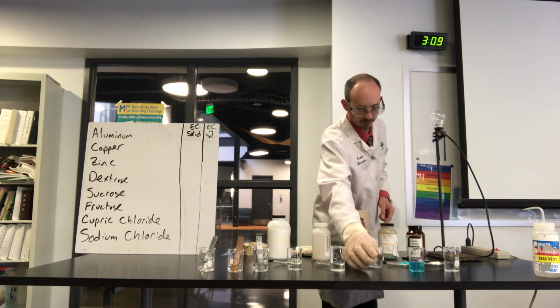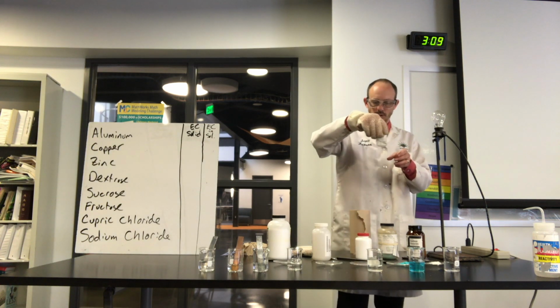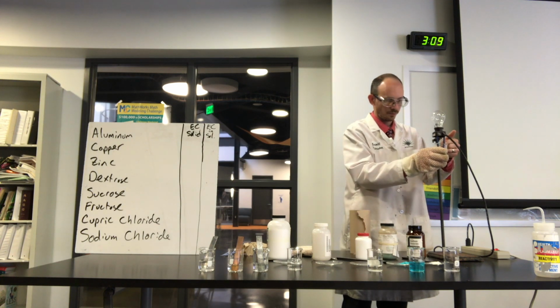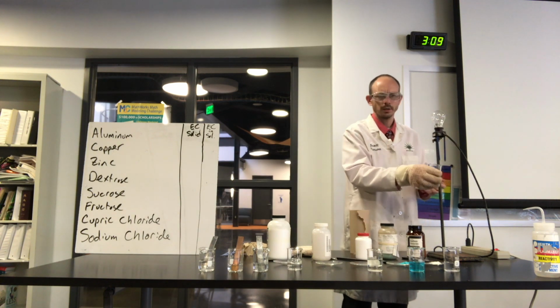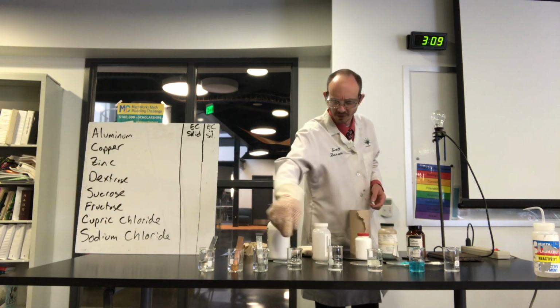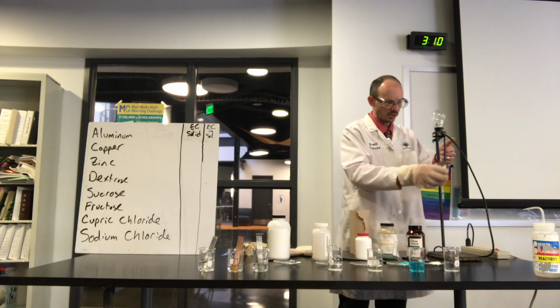Nothing. All right, what about this one? Nothing. But some of it did dissolve. All 5 of these did dissolve. Okay, the metals, maybe not, but all 5 of these did dissolve.